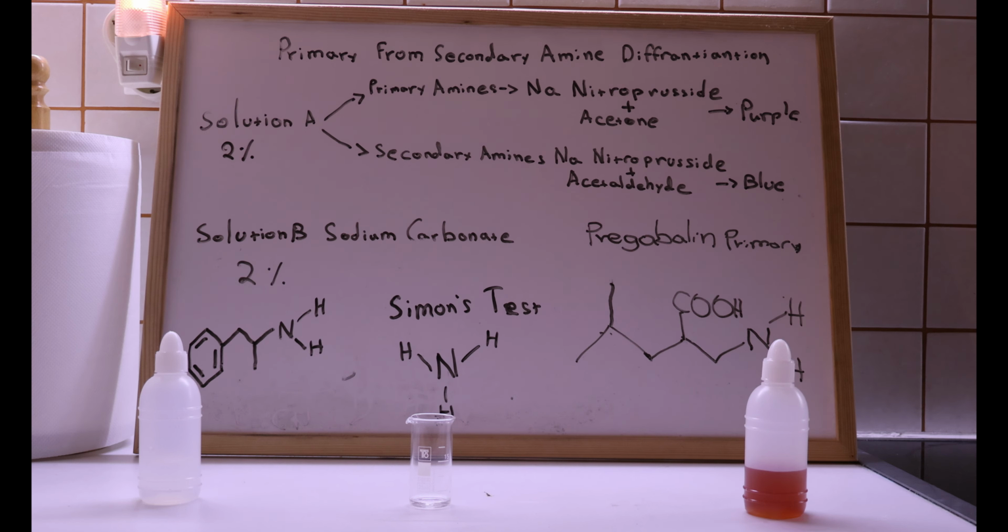First is a way to differentiate between primary and secondary amines and to detect amines in general.